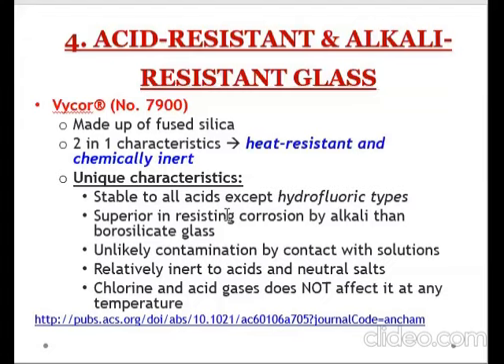But this one, in-emphasize natin, kasi medyo mataas-taas rin yung percentage ng silica niya. Okay? Same with your borosilicate, diba 80%. So, most probably, sila borosilicate, aluminosilicate, same with this type of glass, mako-corrode din ni hydrofluoric acid.